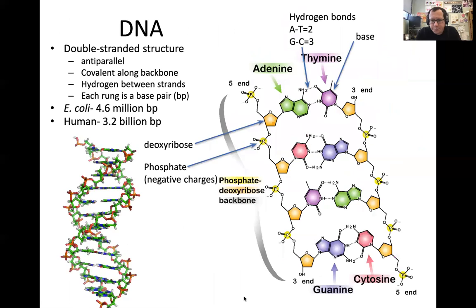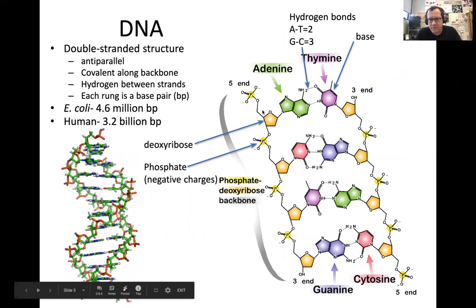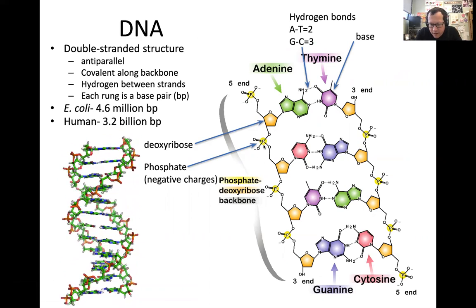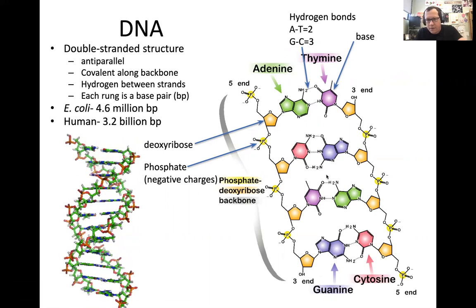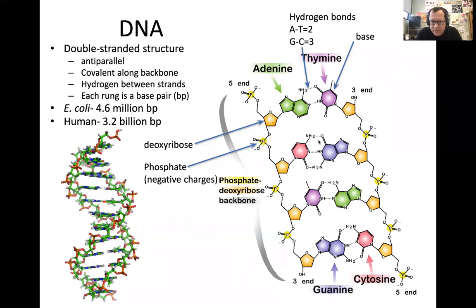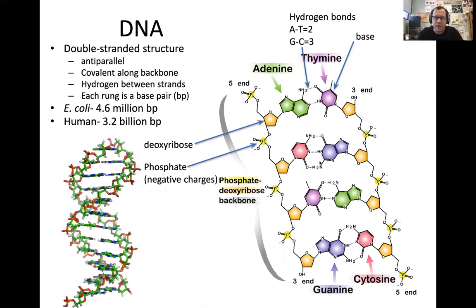Okay. And if you think about looking at a structure like this, it isn't exactly what would be considered a restriction site, but think about right here getting cut, and then down here getting cut. The only thing holding that region together in the middle would be these 5 hydrogen bonds, and that would allow the DNA strands to separate there.